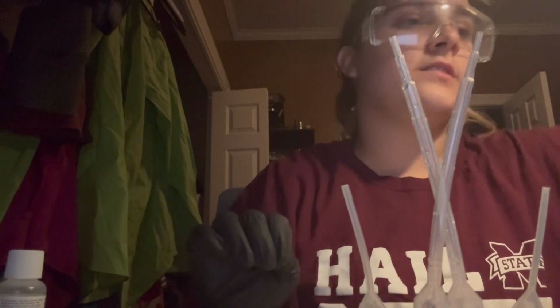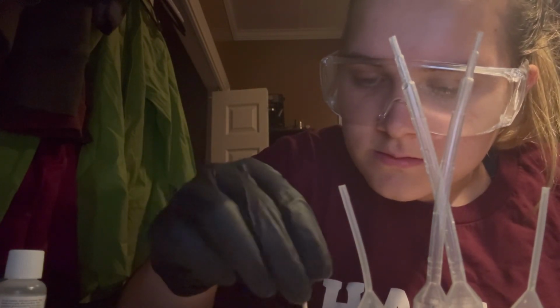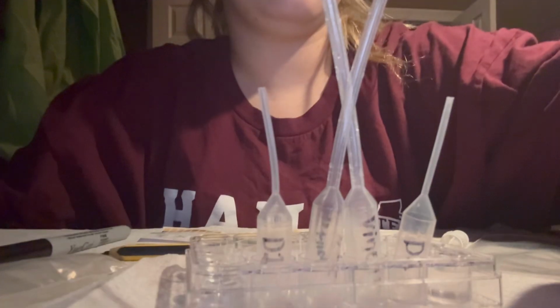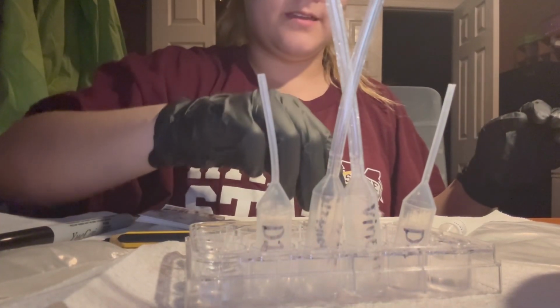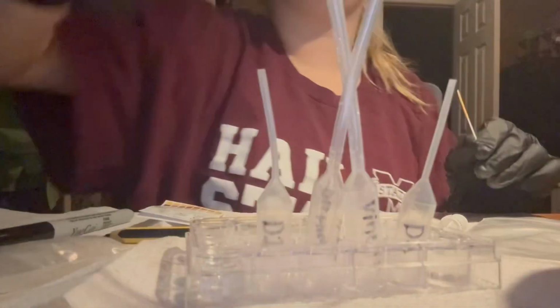It says stir the solution with a clean toothpick. So let's grab a clean toothpick and we'll stir the solution and properly dispose of the toothpick. Alright, and on to the next part of the experiment. I've cut up all these pH strips into half strips like this. Now I'll be measuring the pH of well A1.